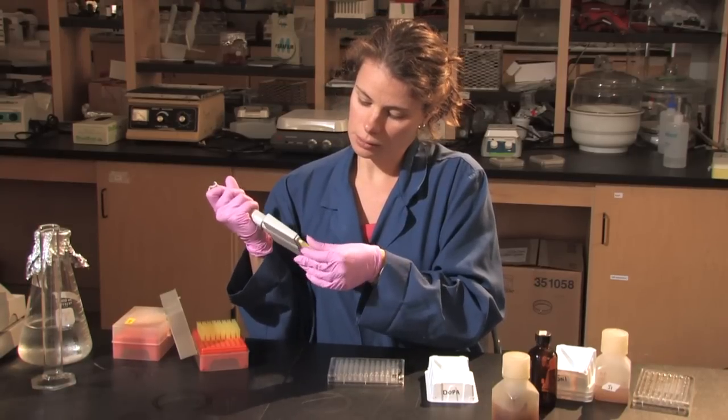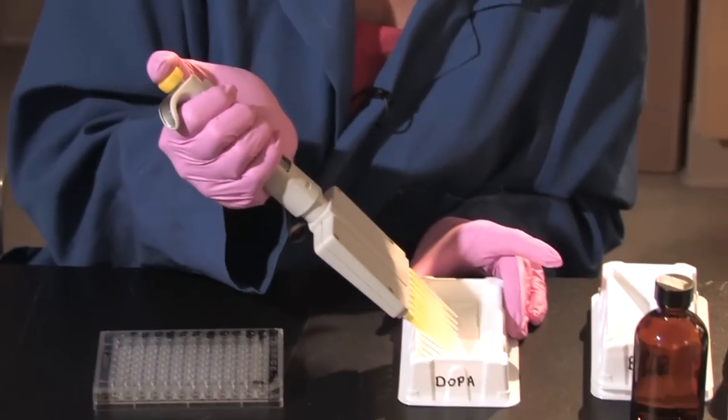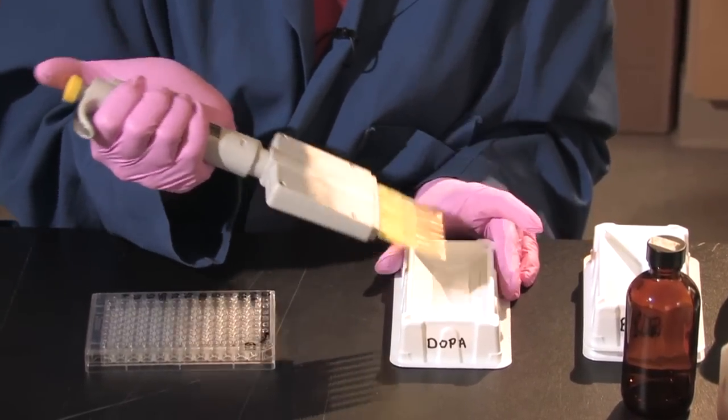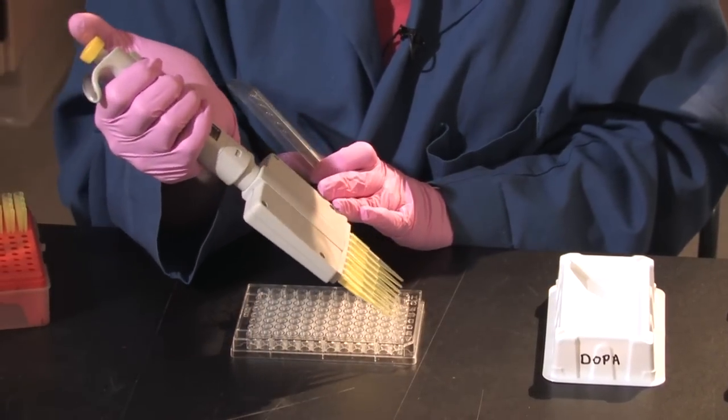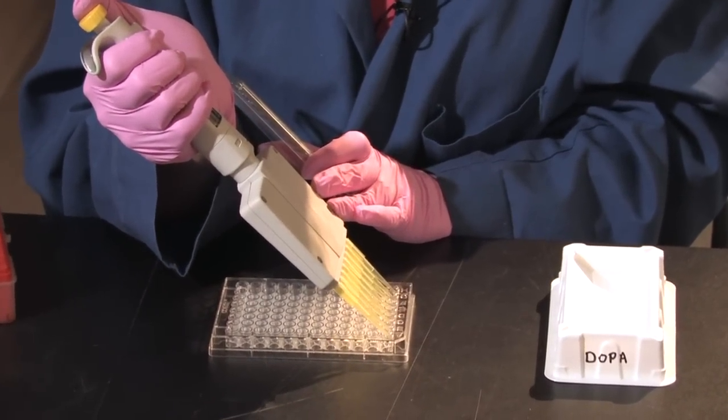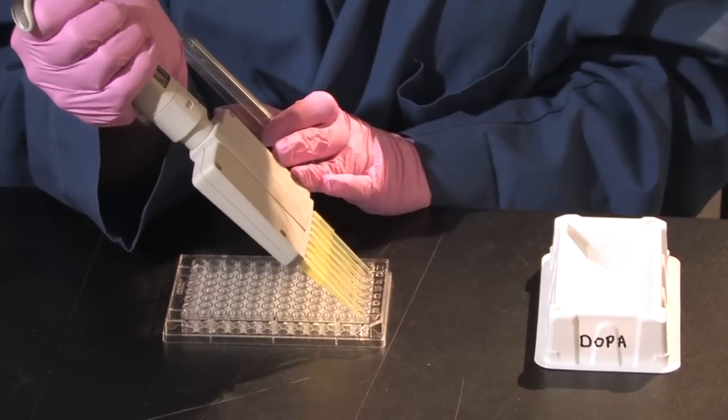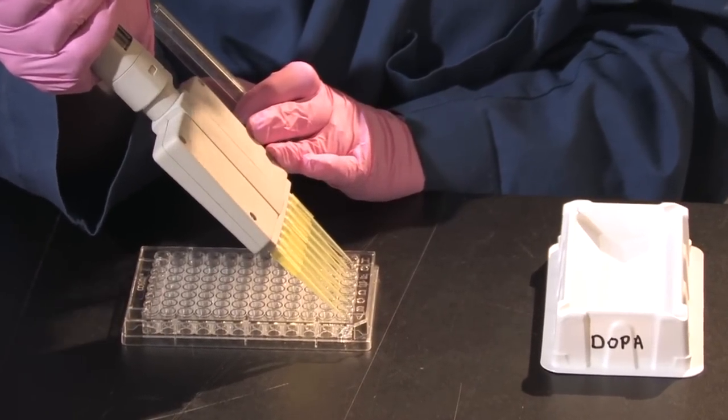I'm going to add 50 microliters. I want any color that comes afterwards to be due to the enzyme, the phenyloxidase acting on the DOPA and not the DOPA itself. So I add 50 microliters to each of the wells within the row.